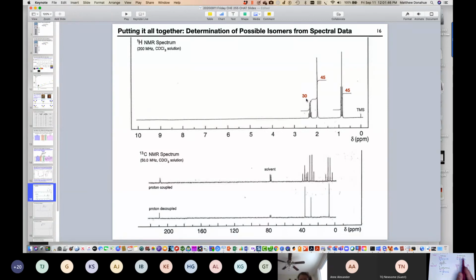The data that is shown is 2-butanone. So what you did in your mind through determining the unique sets, then the ratios, is actually what's being shown in this piece of data. We have 1, 2, 3 unique peaks. Then the ratio is 2 to 3 to 3.